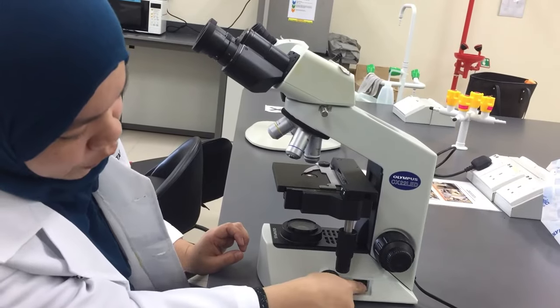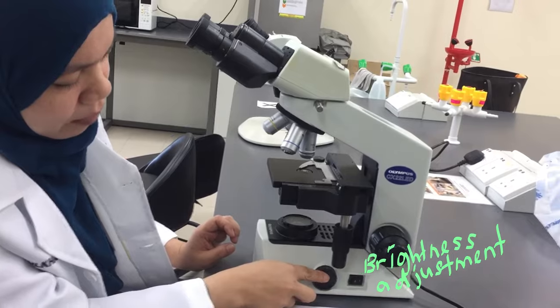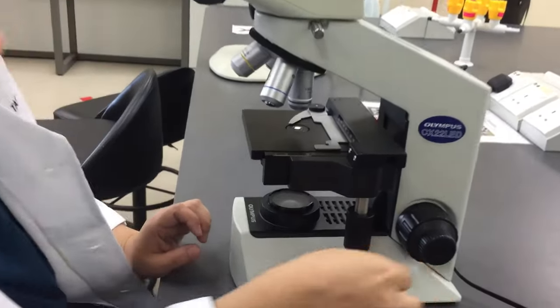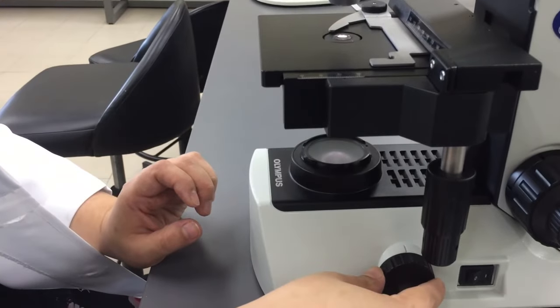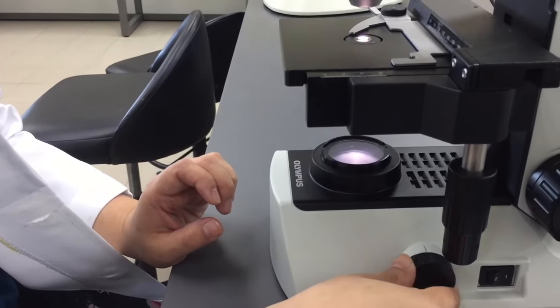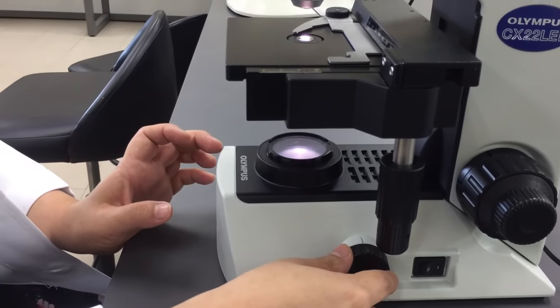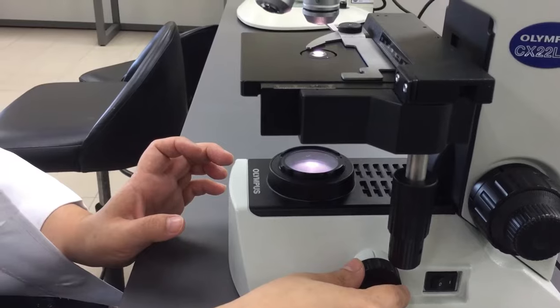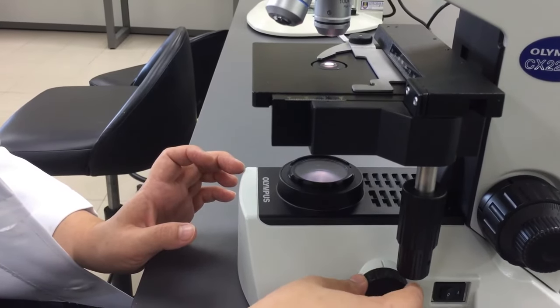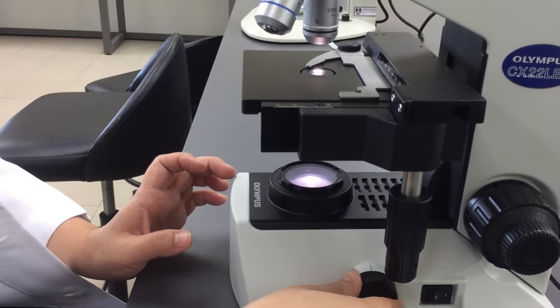The light source has five intensity levels. It starts with number one intensity and goes up to two, three, four, and five. As it goes higher, the light will go brighter. You can see here as I lower down the light and then increase the light intensity.